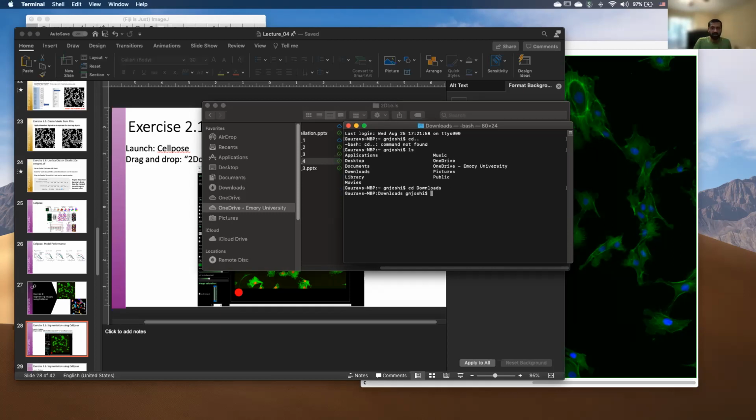Okay, so I tried to go there manually. Hopefully this should work out. Let's see.